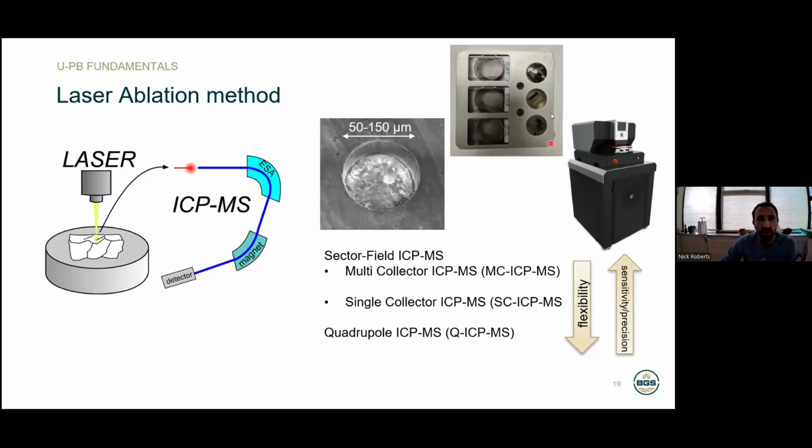Here are some images of one of our cells, and these are thin sections we can use, or we can use carbonates in epoxy blocks in the laser ablation system. And we can do the measurements themselves on a variety of ICP-MS instruments.